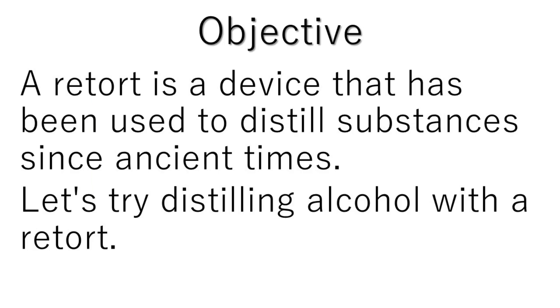A retort is a device that has been used to distill substances since ancient times. Let's try distilling alcohol with a retort.